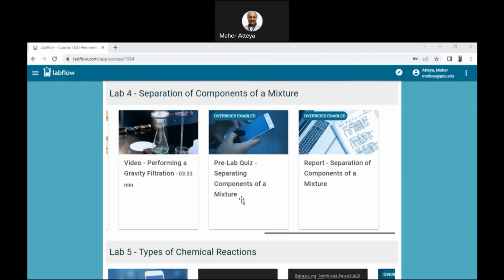Okay, and we'll insert another arrow here. This arrow will show us that the most important stuff is here. This arrow is blue. Fill it.